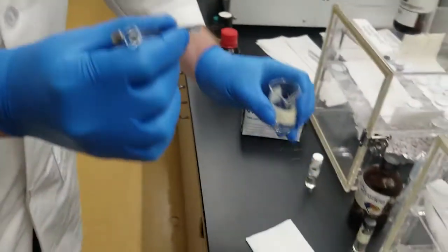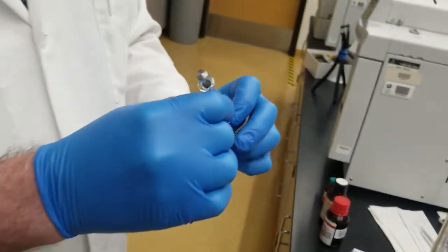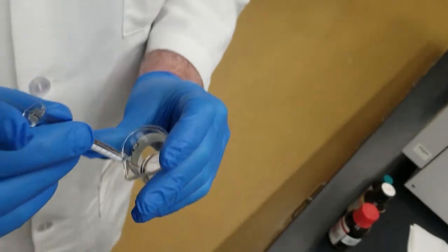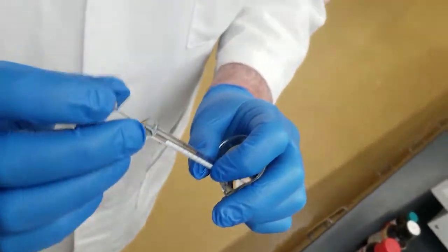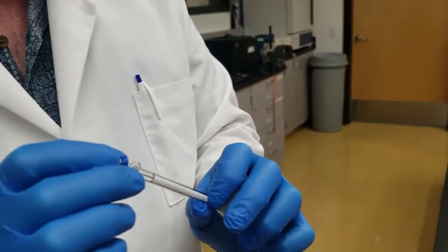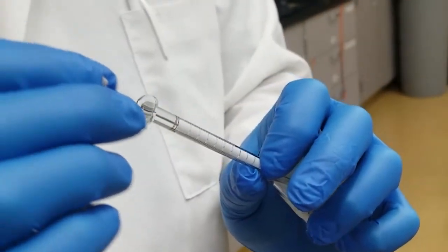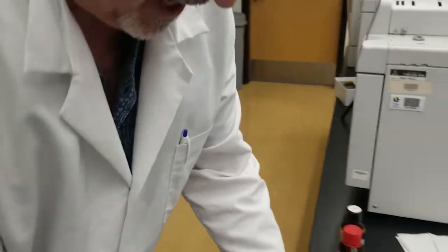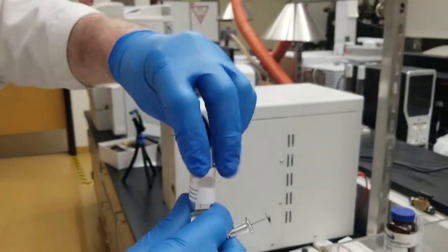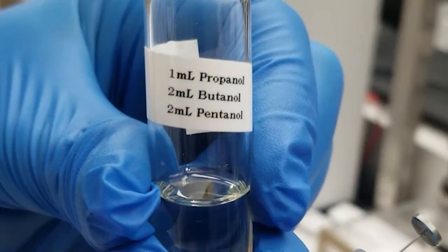And so what we have to do every time we use a syringe is make sure that it's clean from any prior sample. So I've got some methylene chloride here, and I'm just running it up and down to rinse out the syringe. Once I've done that, I'm going to get some sample. So I've got a mixture of propanol, butanol, and pentanol.